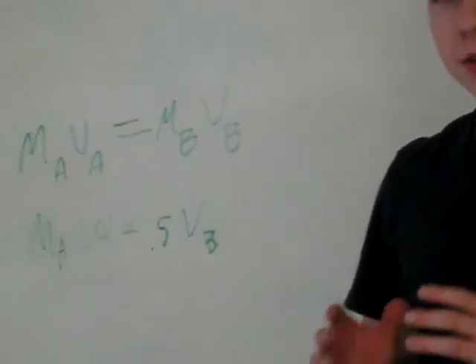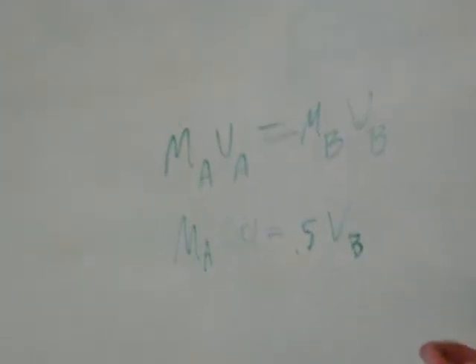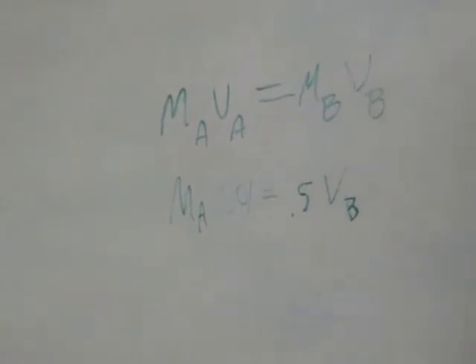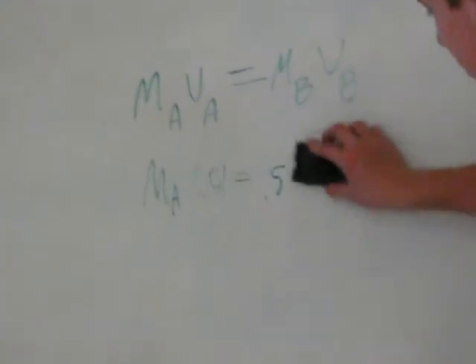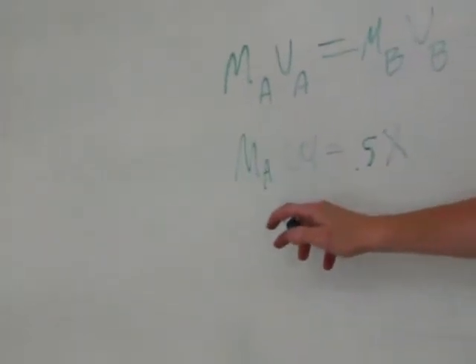Now once the acid turns pink and remains pink for a good amount of time, then we know that we have reached the point where the acid is neutralized. Then we take the reading of the amount of base that we've used, which will be our volume of base in this equation, and then we can plug that in and solve for molarity of the acid.